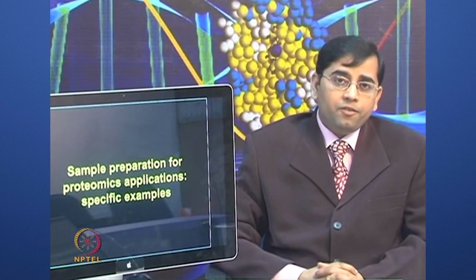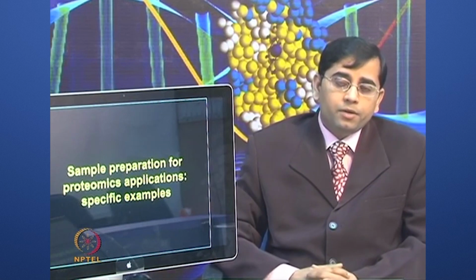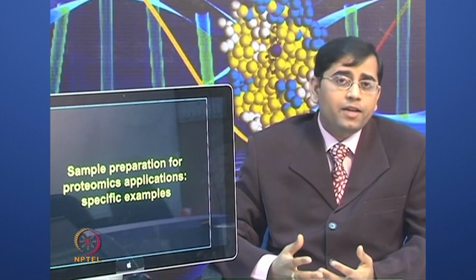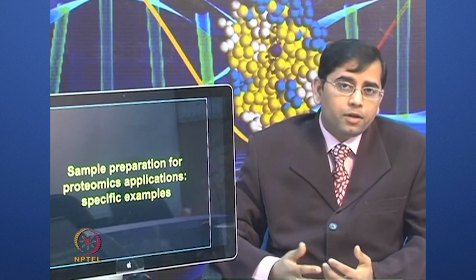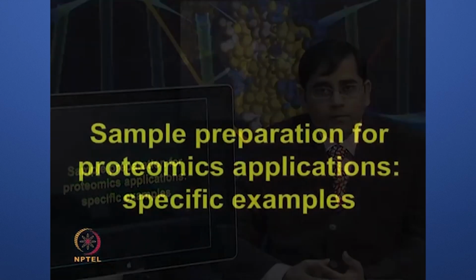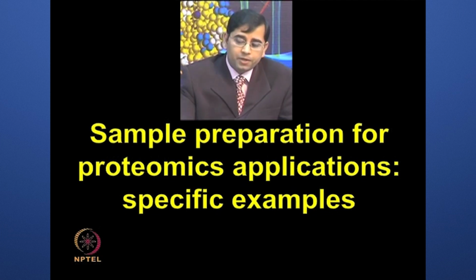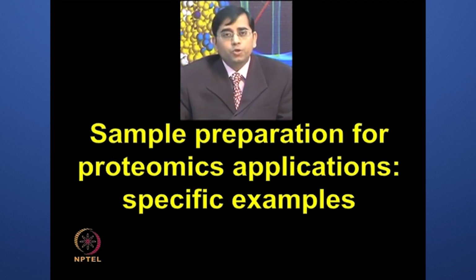So, we have so far covered different strategies of preparing a very good sample for proteomic applications. Now, let us try to apply some of this knowledge to specific applications, such as serum proteome analysis and bacterial proteome analysis.